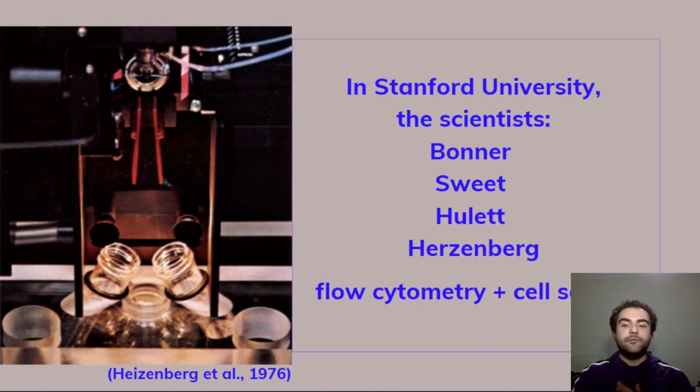The speed of sorting has increased too, and the parameters have increased up to 32 different colors, plus 2 scatter parameters. The working mechanism is mostly the same between the first invented form and today's version, but the number of components gets higher as it gets more complex.